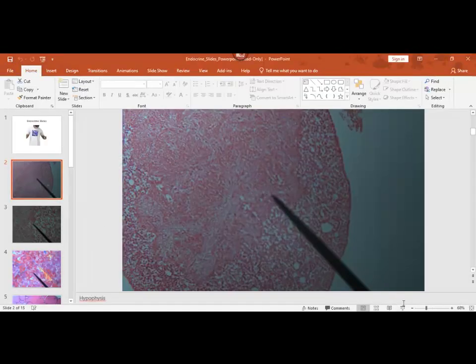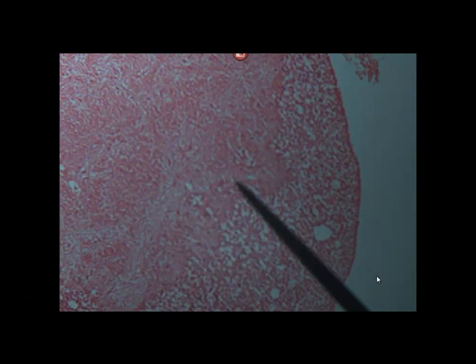So this might be a little dark, and I'll just make it big screen, and I apologize. I don't know why it's so dark, but here's a pointer from the microscope. Now, first few things you want to notice. Here's kind of a little division between the two lobes. This in the front is the anterior lobe. It's got the white spaces. This in the back is the posterior lobe.